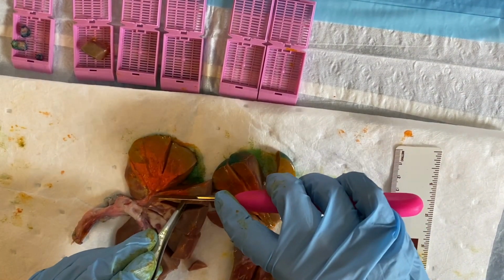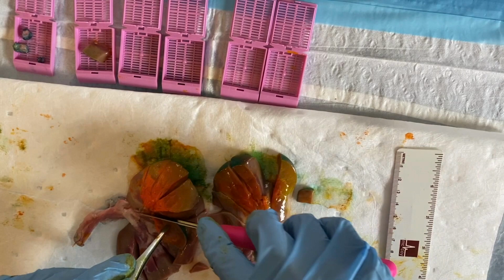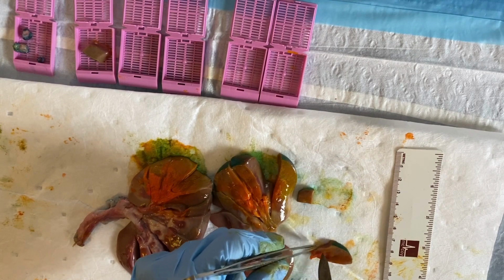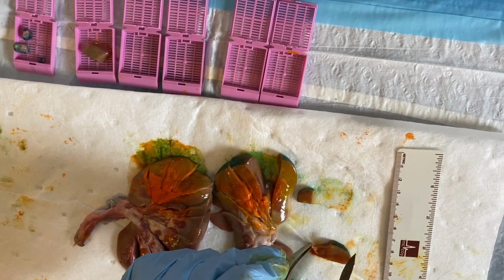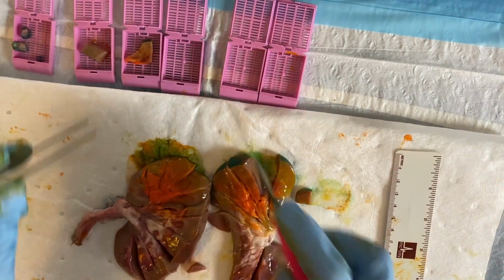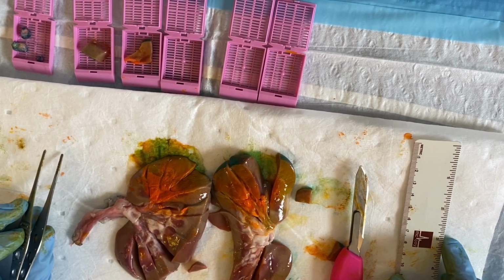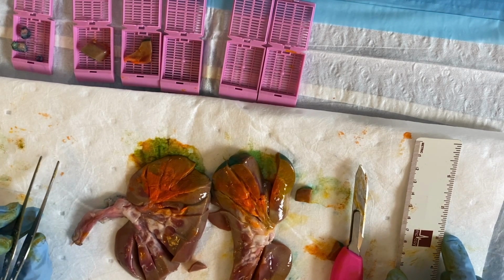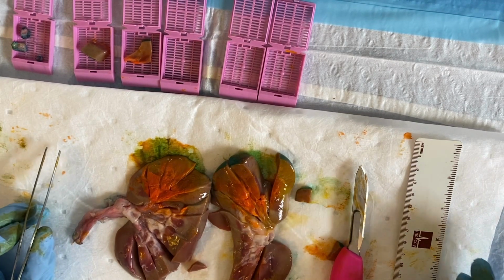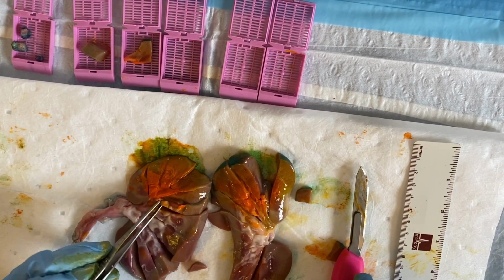I would take tumor to my renal pelvis, which you can see I have here. I want to demonstrate that white tan adipose tissue there. Okay. And then depending on the size of my lesion, I would of course take 1 per centimeter, and that would include the tumor to outer surface, which could be again capsule, perinephric fat, or Gerota's fascia, tumor to the renal pelvis and renal sinus fat.